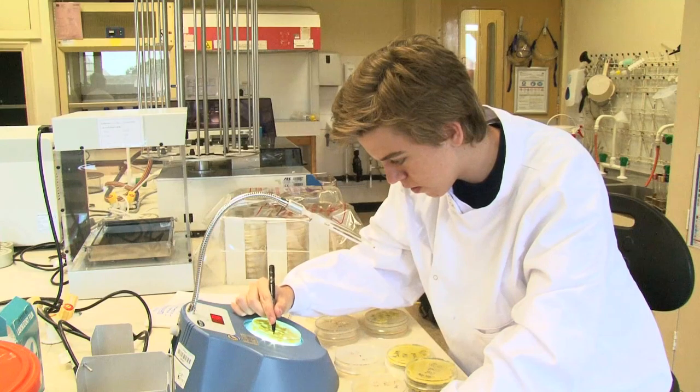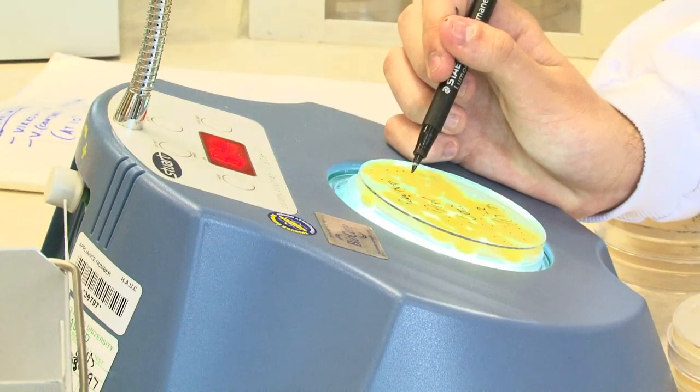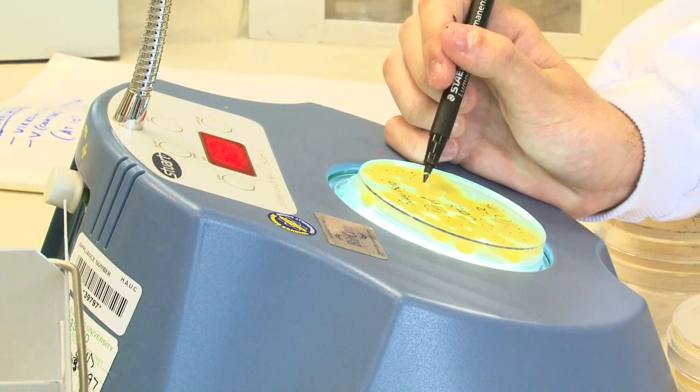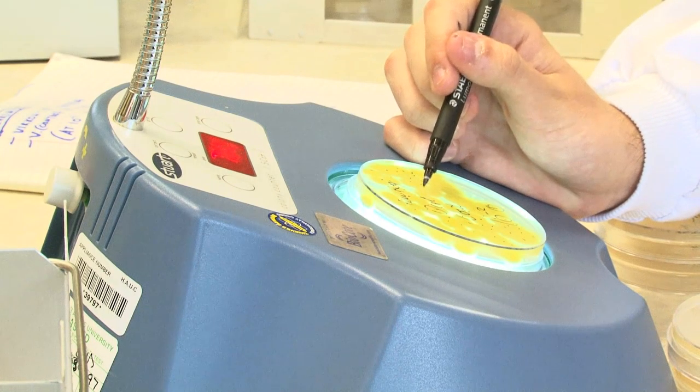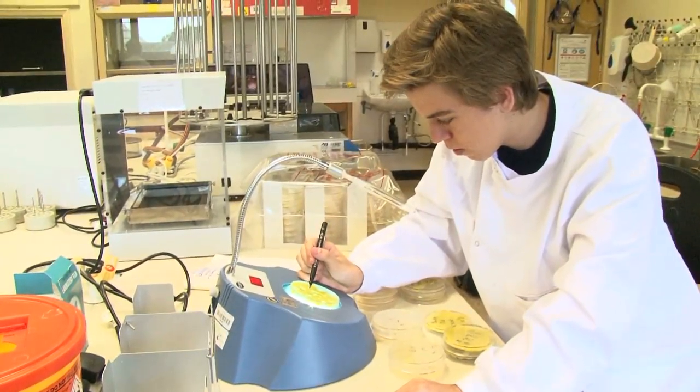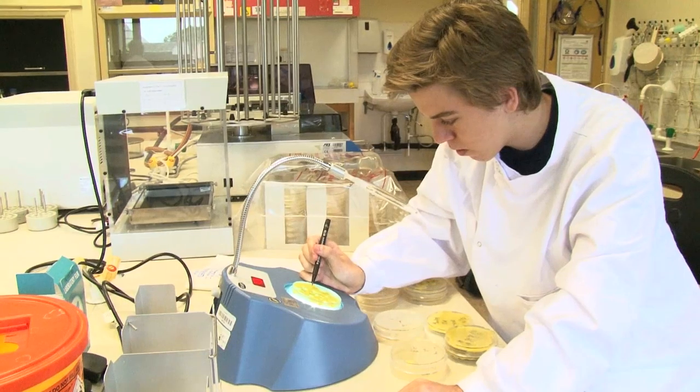I have been looking at the resistance of certain fungal spores to lab disinfectants. The fungal spores we've been looking at are Saccharomyces cerevisiae, Penicillium expansum, Penicillium roqueforti, and Fusarium graminearum.